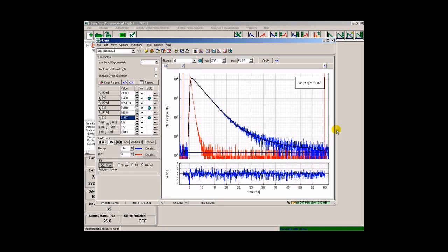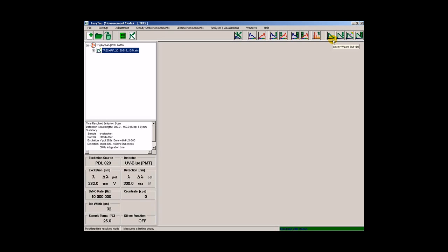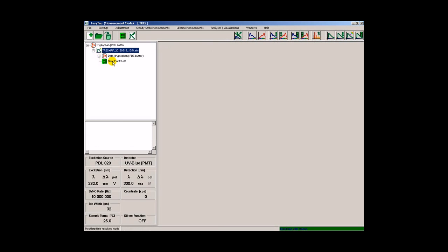Closing Fluofit takes us back to the EasyTau software. The result of our fitting session automatically gets attached to our measurement container.